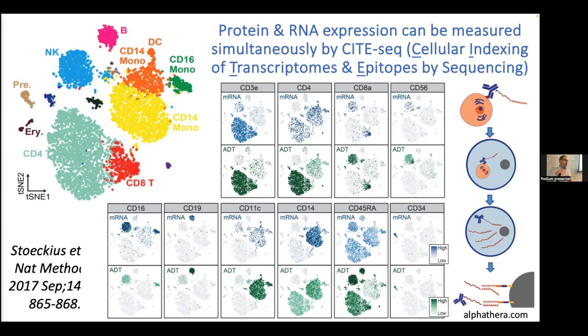You sort of think of your gene expression levels as a distribution. You have some very highly expressed genes. Most of them are in the middle, and some are expressed at a very low level. When we do sequencing, you're basically grabbing or sampling from that distribution. So you see basically all the highly expressed genes. You see some of the genes expressed in the middle. But if you're grabbing from this distribution, you're actually very unlikely to grab those genes that are expressed at a very, very low level. And depending on how many sequencing reads you generate, that's how many samples of that population you have. So if you only do, let's say, 50,000 reads for a single cell, that's 50,000 chances to try to grab a rare transcript. And sometimes it's actually not enough.